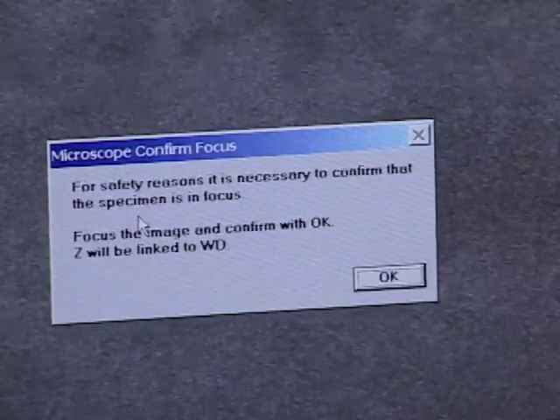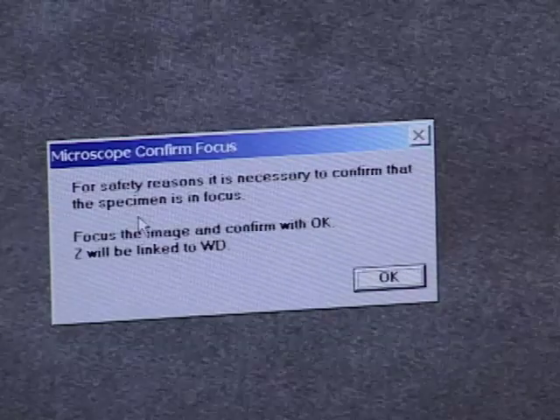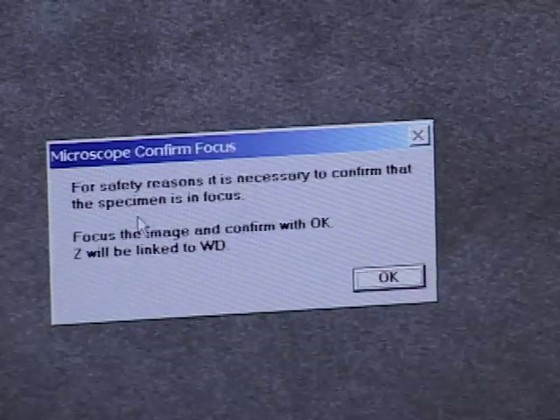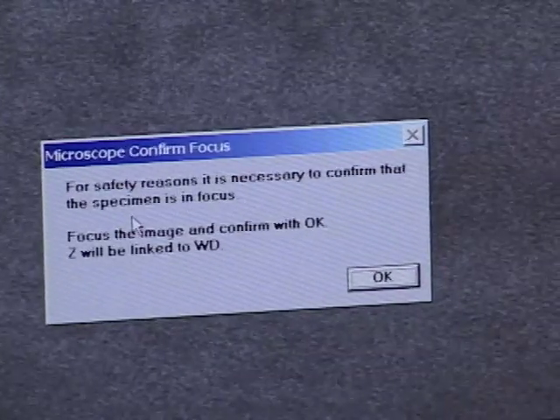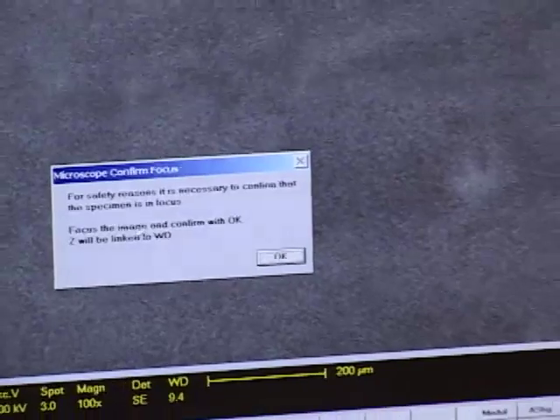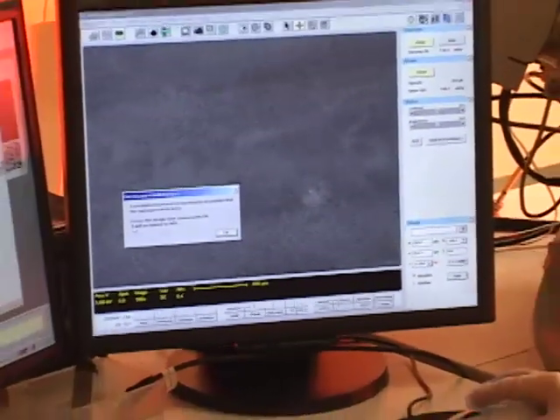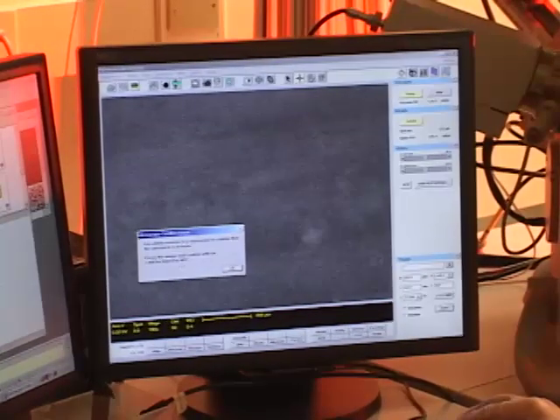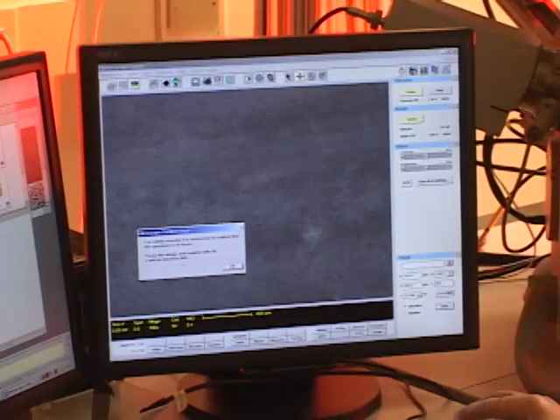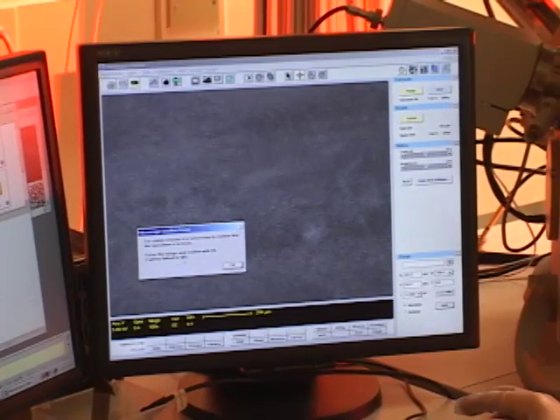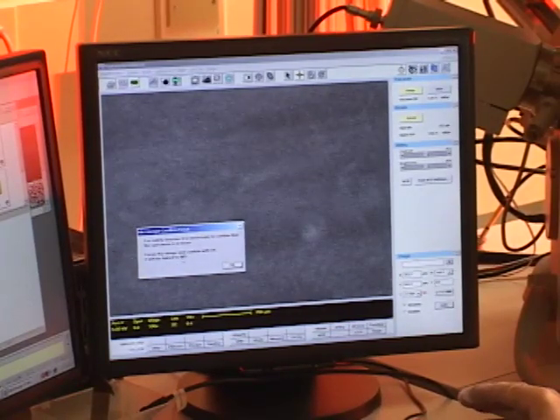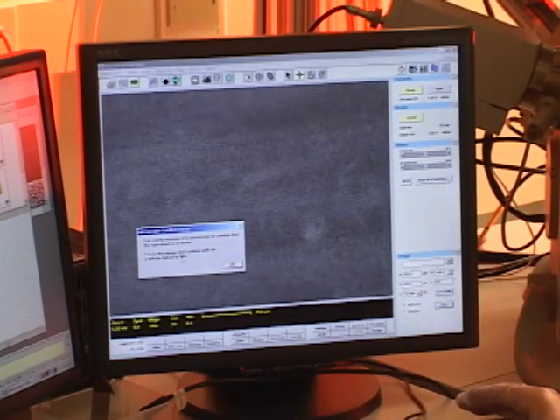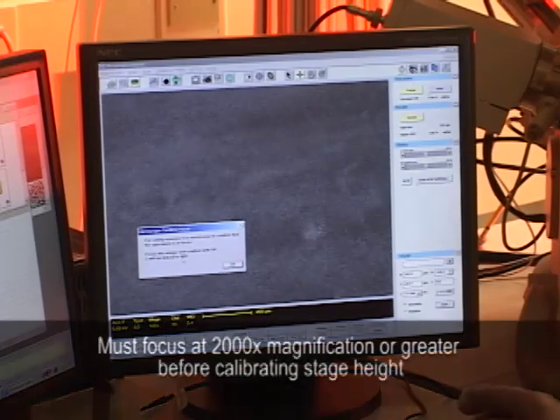But once we've focused on the surface of the sample, we'll be taking a measurement of the distance from the pole piece to the sample itself. And then we can calibrate Z, the stage height position, with the working distance. The working distance being the distance from the pole pieces to the sample surface where the beam is in focus.